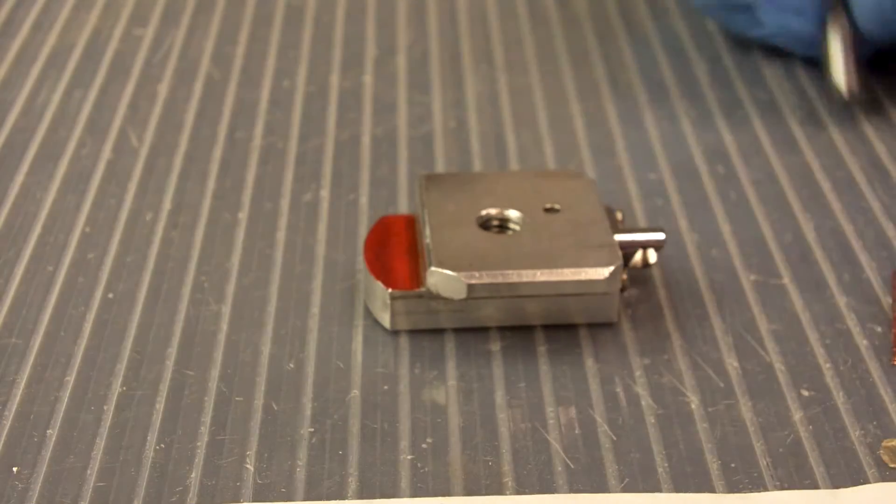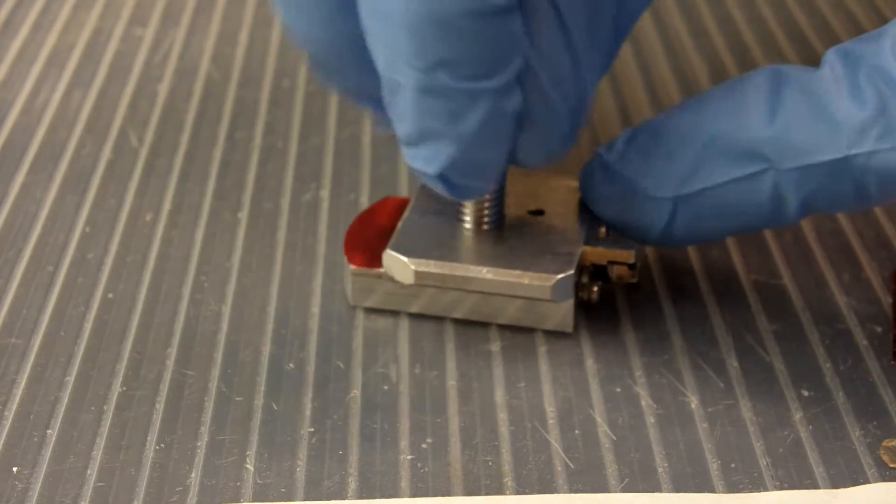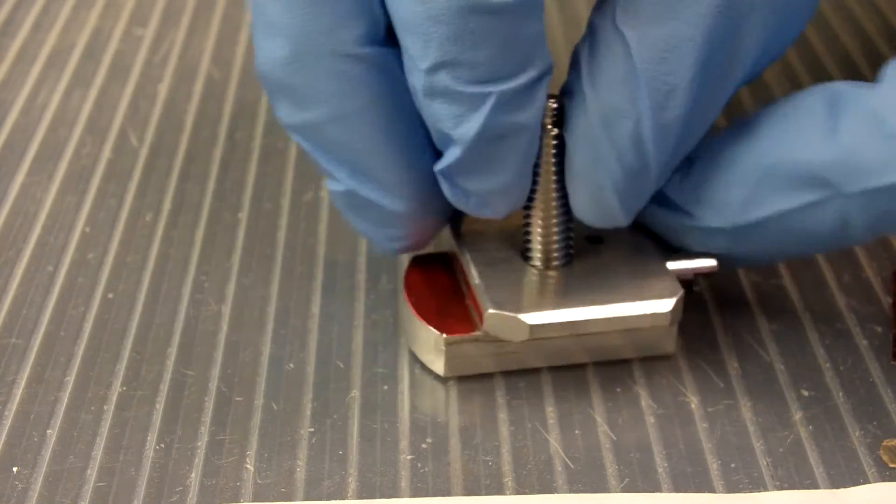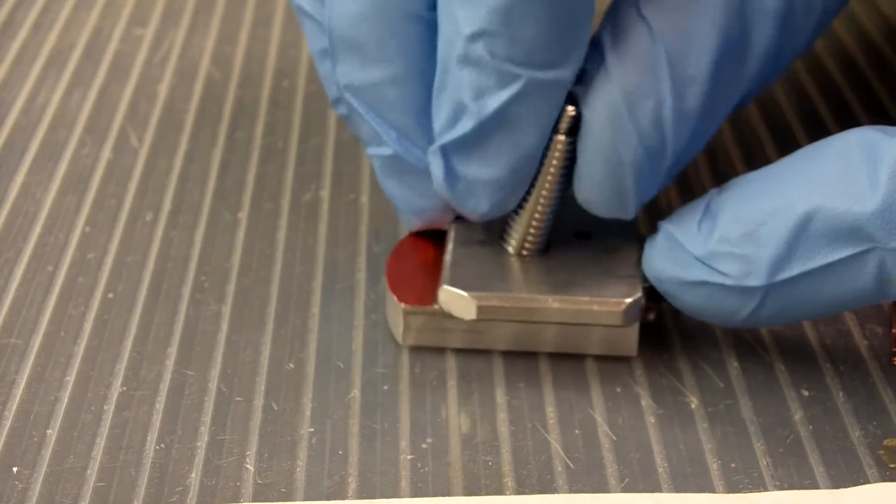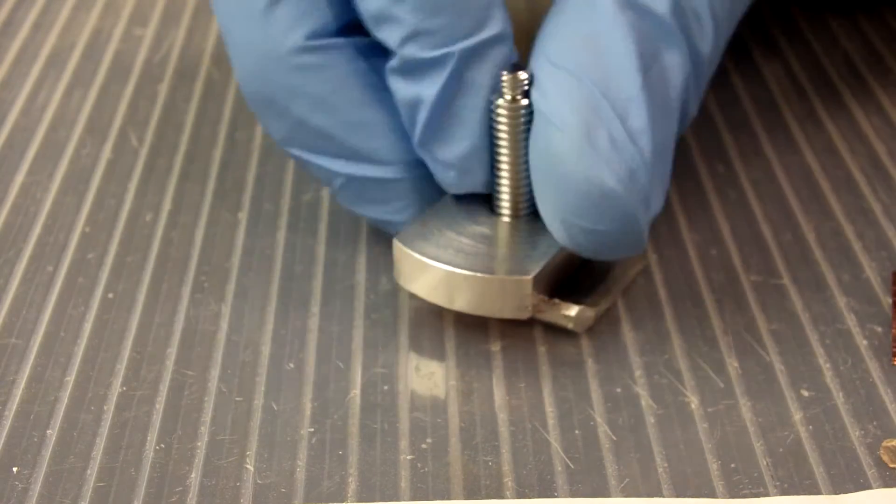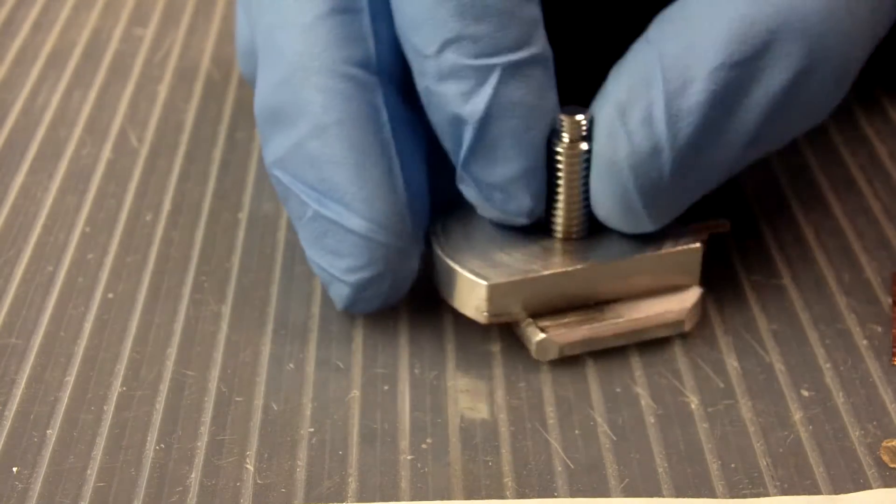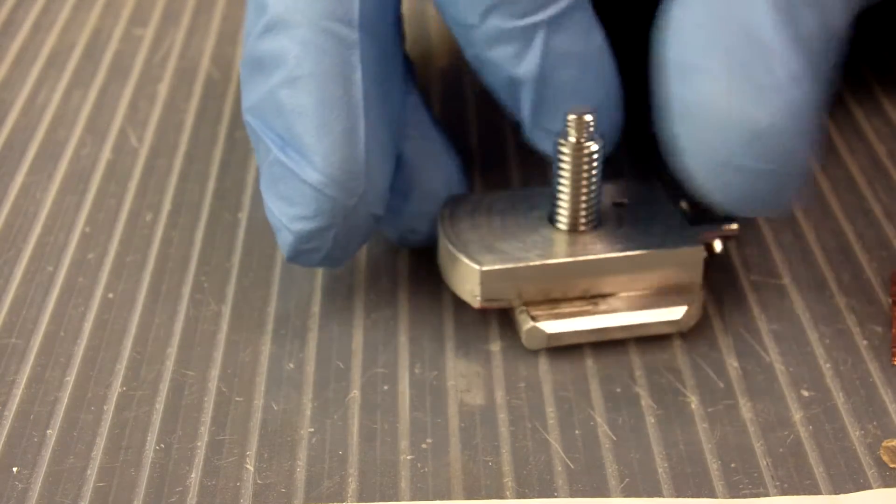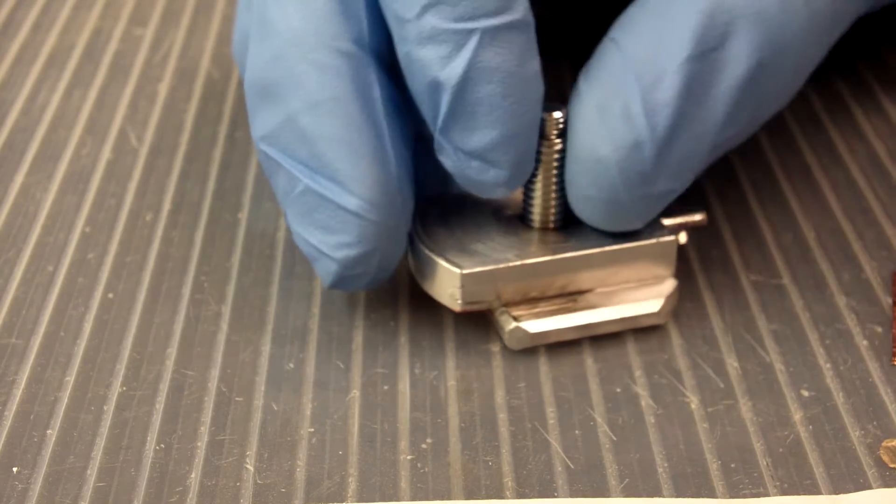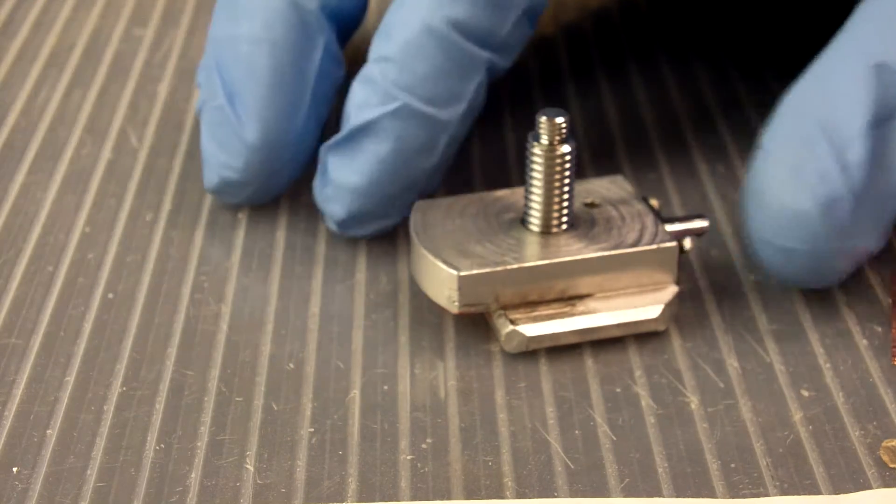This means that we cannot screw the screw in from the wrong side. Even though I've seen people try it really, really hard, it doesn't work. As a side note, this is a good rule to follow when you're using an electron microscope. If you're trying really, really hard to do something, it probably means you're doing something wrong. Physical operations like this should not be strenuous.